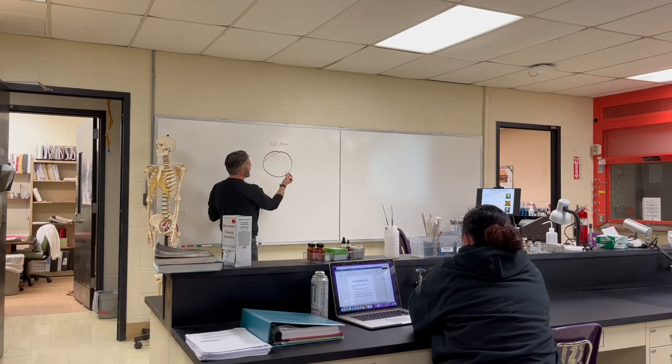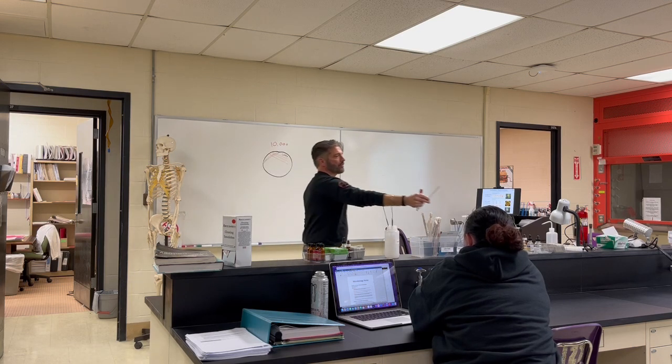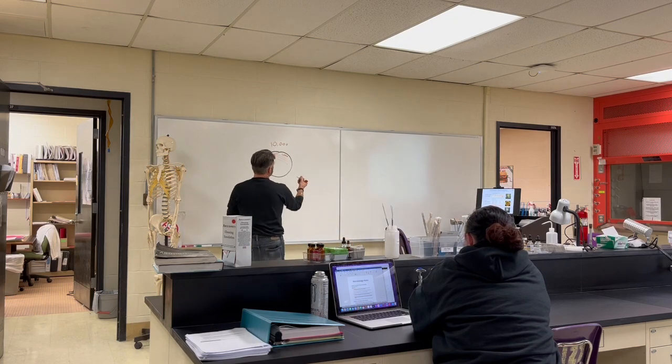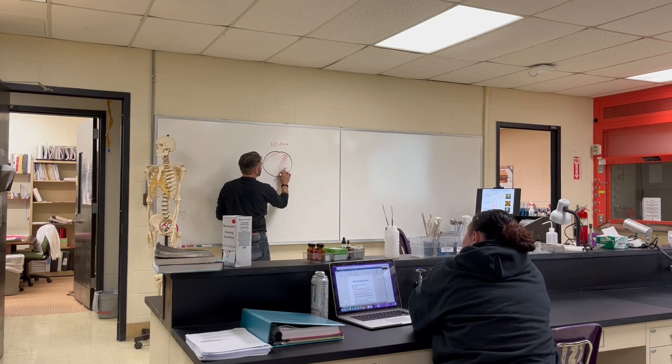How many bacteria do you think I have there? Doesn't matter. 1,000. I flame it again. It's red hot, 0 bacteria. Swab it through here. Let's just say I have 23.